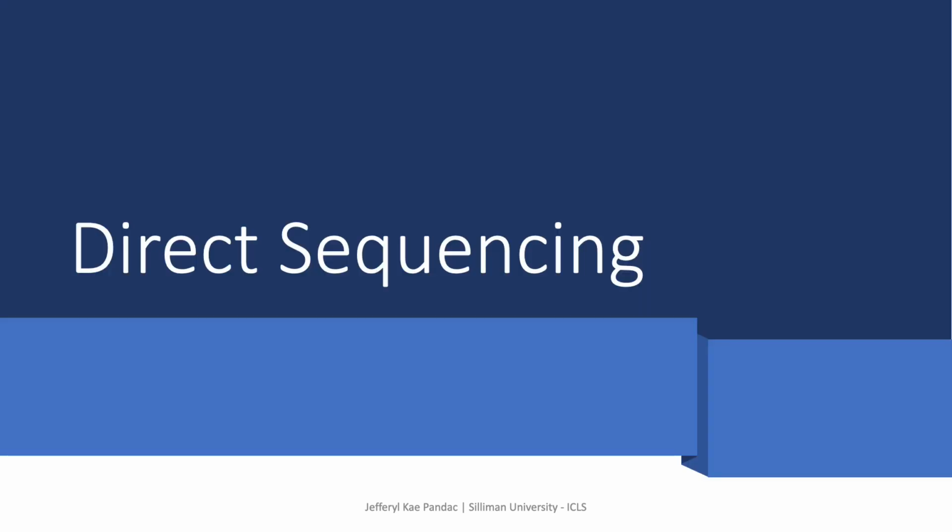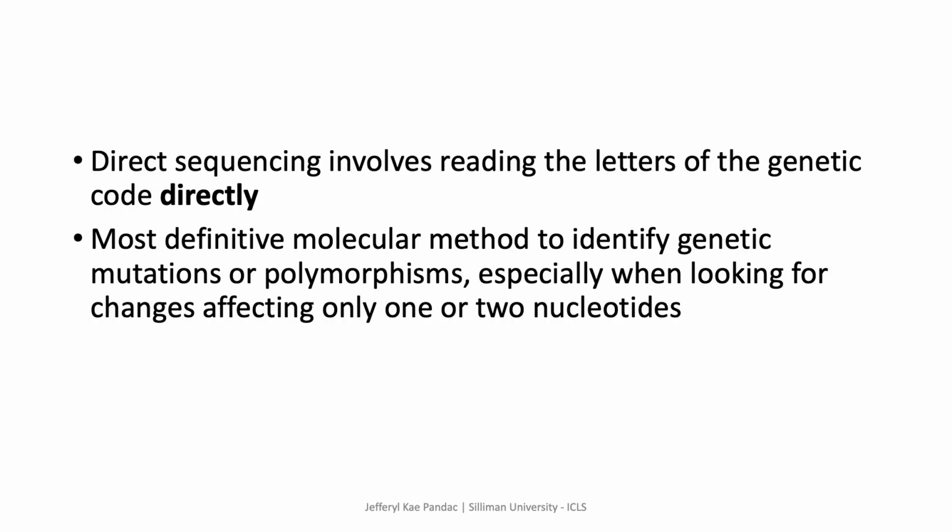So now let me start with the first major DNA sequencing technique that I will talk about, that is direct sequencing. When we talk about direct sequencing, it means that the letters of the genetic code or the different nucleotides are read directly as if reading the sequences using a magnifying glass.